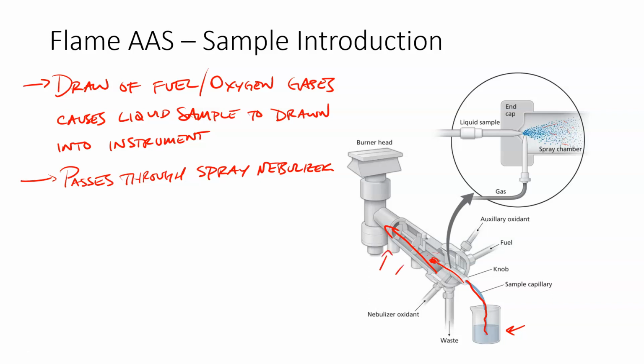This instrument has two. The one we have just has a single. It's a little plastic piece. It's called a flow spoiler. And what it does is it essentially is a barrier. It's a stop. Anytime you have droplets of solution where the solvent hasn't evaporated away, that flow spoiler will stop anything that's still in the liquid phase while allowing the air to flow around it. Right? All the solvent that doesn't evaporate after this nebulization is drained off into a waste container here.